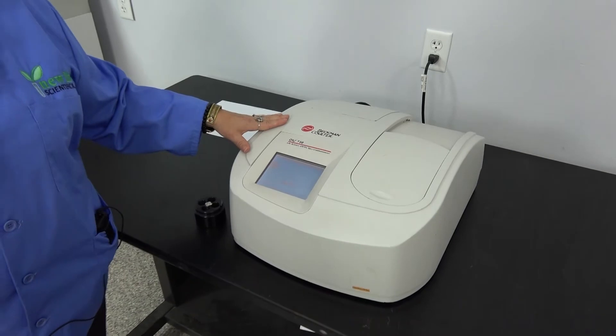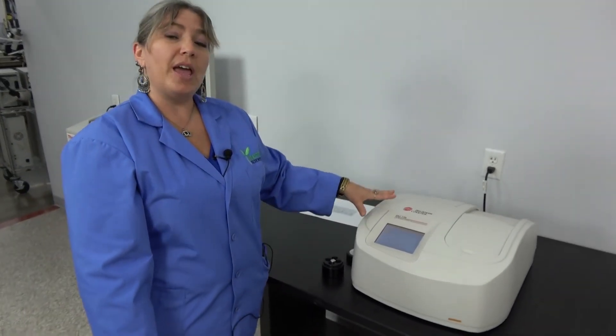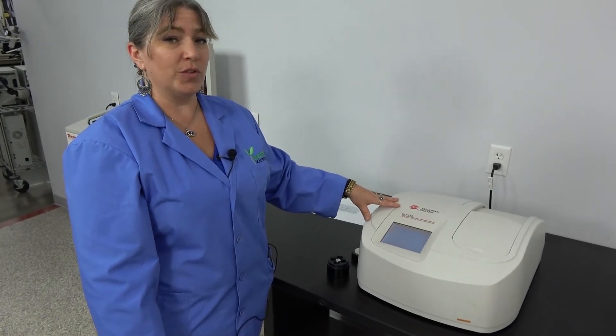This instrument has been fully checked out by our in-house technicians. It is backed by our 90-day warranty and we have it on hand at our Crottersville, Ohio facility.